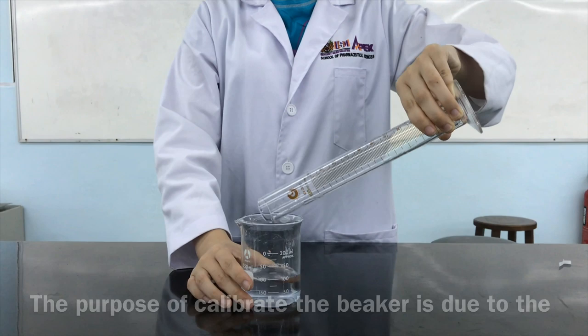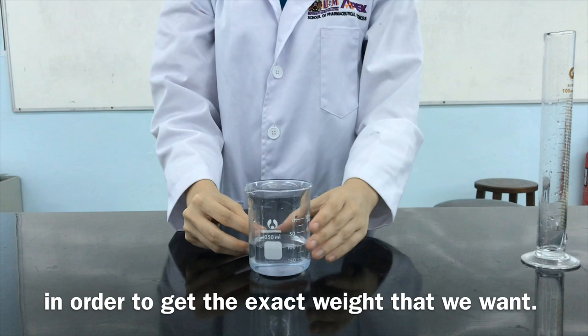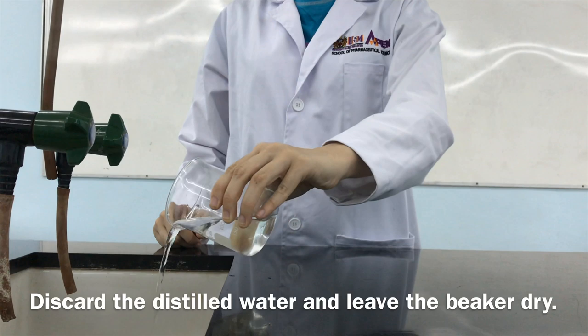Calibrate the beaker with 100ml of distilled water. The purpose of calibrating the beaker is due to the stickiness of the jelly. We will prepare 100ml of jelly product and dispense it in order to get the exact weight that we want. Discard the distilled water and leave the beaker dry.